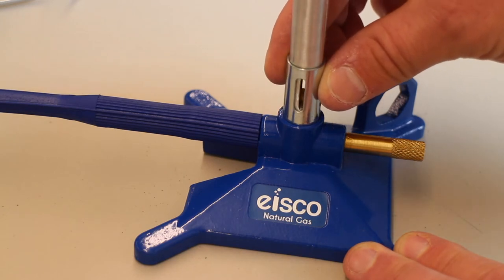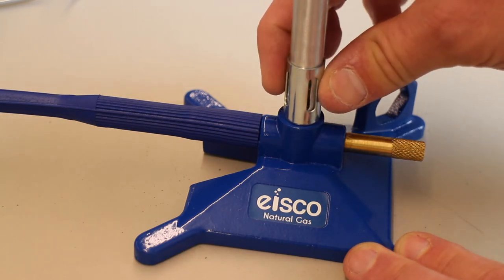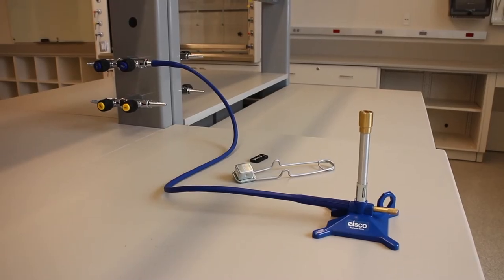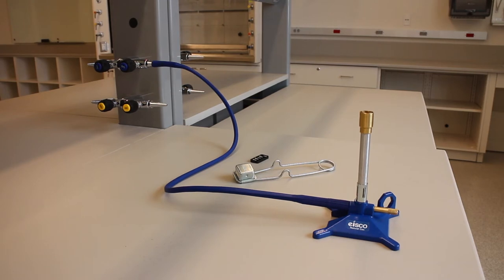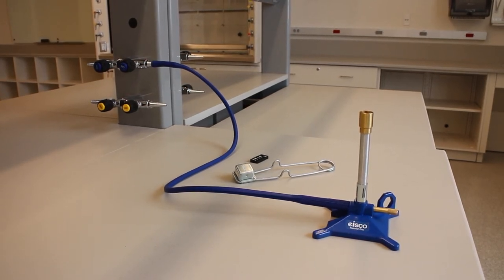The air available for combustion is controlled by turning this cylindrical piece at the bottom of the base of your burner. Control of the air and gas flow allows you to tailor the Bunsen burner's flame to suit your particular application.